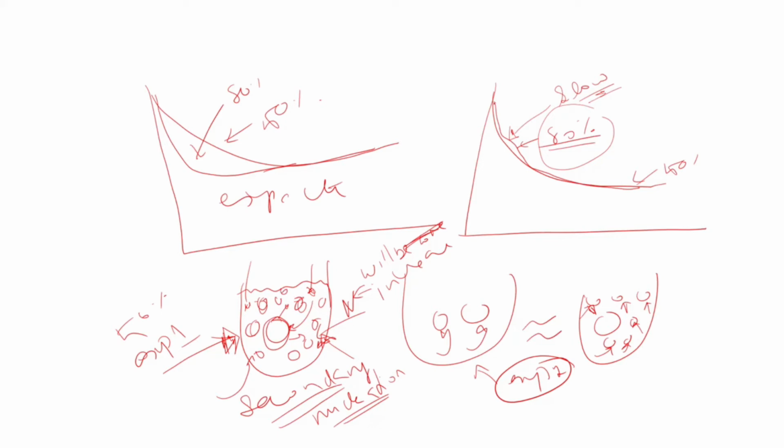So that's why the depletion in concentration is almost similar, no matter whether you start your experiment with the 50% seed or with 80% seeds. So talk a bit about nucleation, secondary nucleation, and just say that this could be one reason.